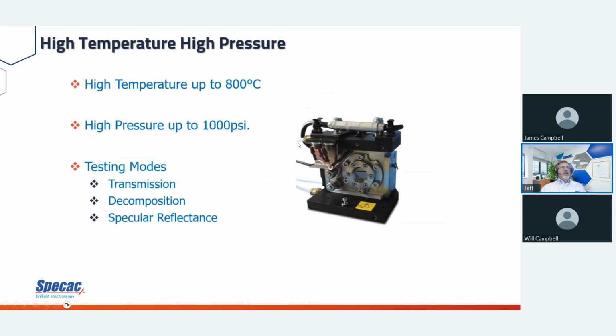As we slide that over to the high temperature, high pressure cell, 800 degrees C and 1000 PSI. Neat thing about this, you can do several different things with it. You can do a straight transmission, put a pellet in there. Decomposition, there's a pan on the bottom so you can heat a sample up and look at all the gases coming off.